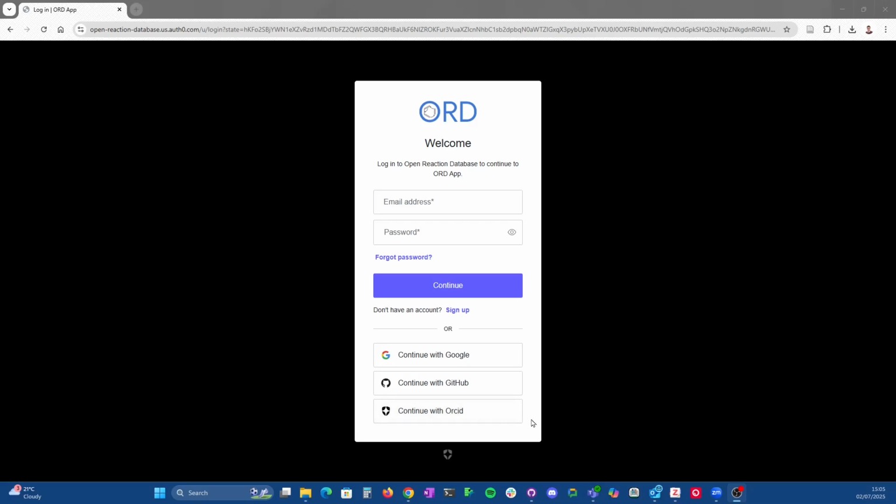Generally we recommend using the service that you're using a lot of the time, and then use that and tell your colleagues about that so they can use those details to share data sets with you. So I'm going to go ahead and sign in with Google, and I'll see you again on the ORD main screen.